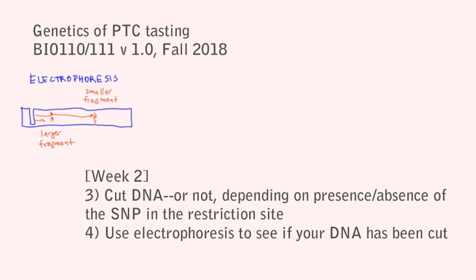Loading the gels with the samples is kind of dicey, and it takes a very steady hand. You want the sample to go into the well, minimizing spillage outside of the well. And this is made just a little bit easier by the loading dye that you will mix with your sample before loading it into the tiny slit in the gel. Now the loading dye does two things. It's blue, so you can actually see your sample as it's going into the well. And also it contains a bit of glycerin, which makes the sample just a little bit denser than the buffer that's already there in the well. And this helps just a little bit to get the sample to sink gently to the bottom of the well.